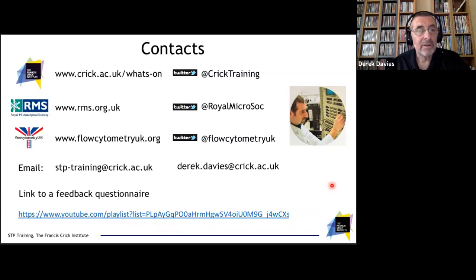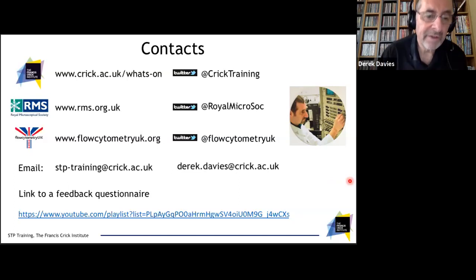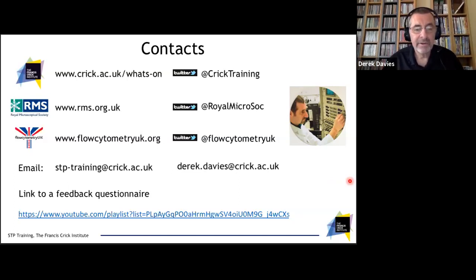Okay, so I'll stop there and I'll take any questions that we've got. So we do have one question that says, can I fix PI? It's a very good question because it depends on what you're looking for. We stain cells with PI for two different reasons mostly: one to look at viability and one to look at the DNA content of the cells. And if I'm looking at DNA content, I do want to fix my cells.